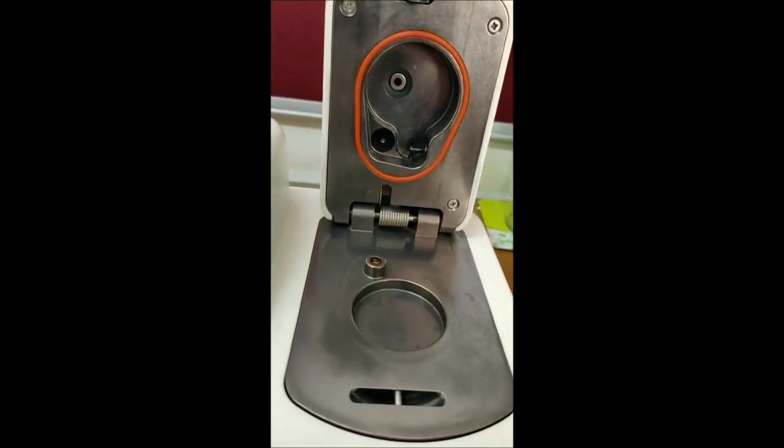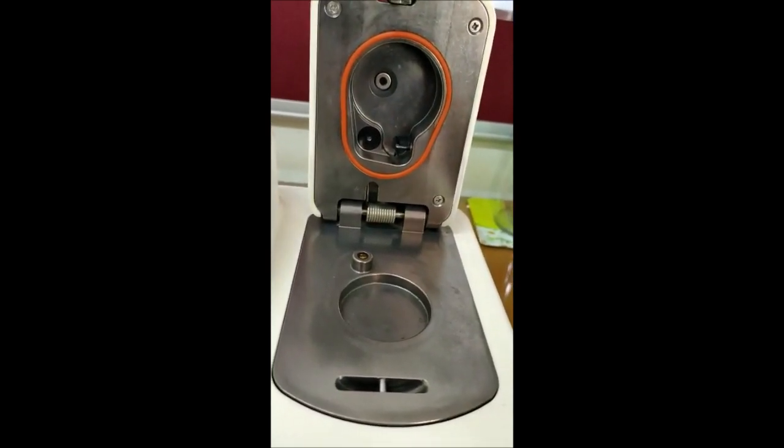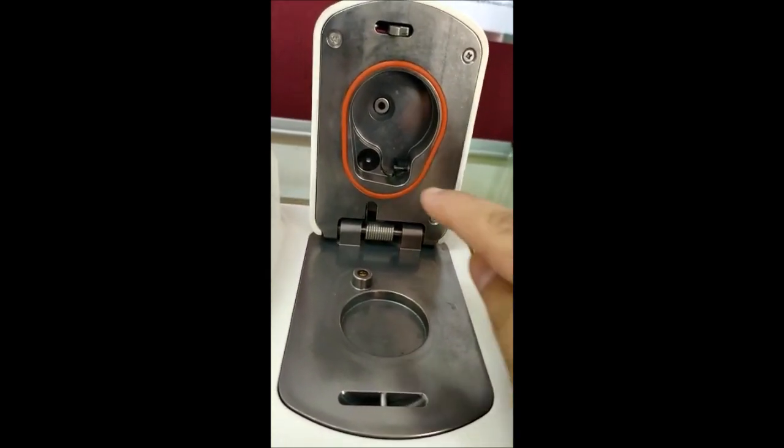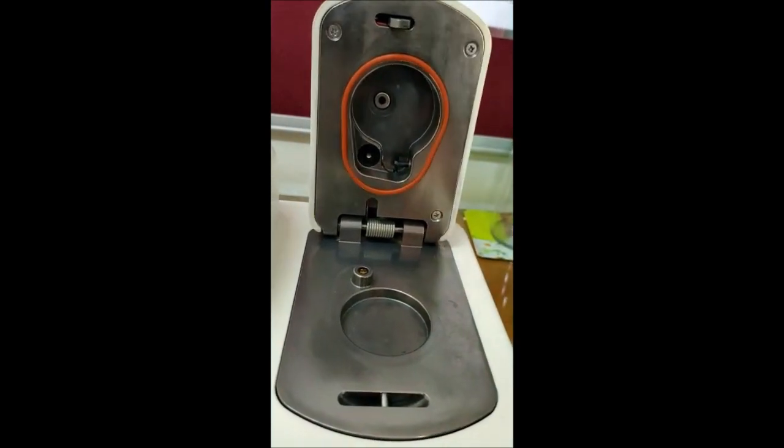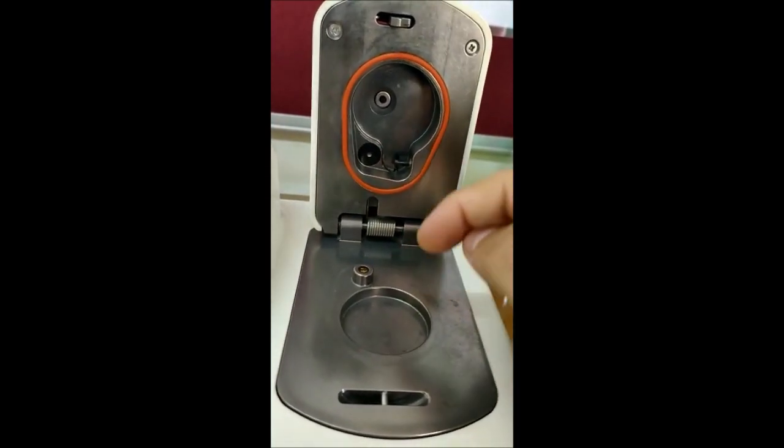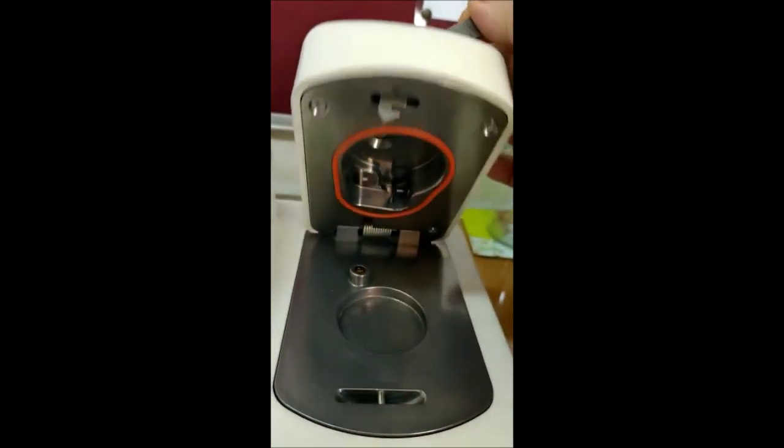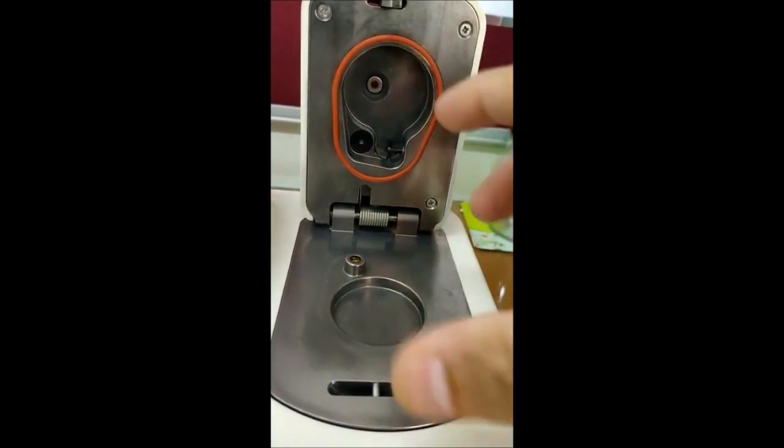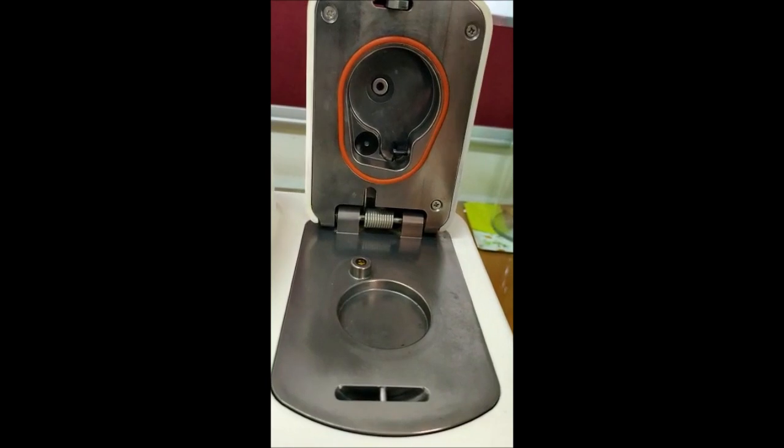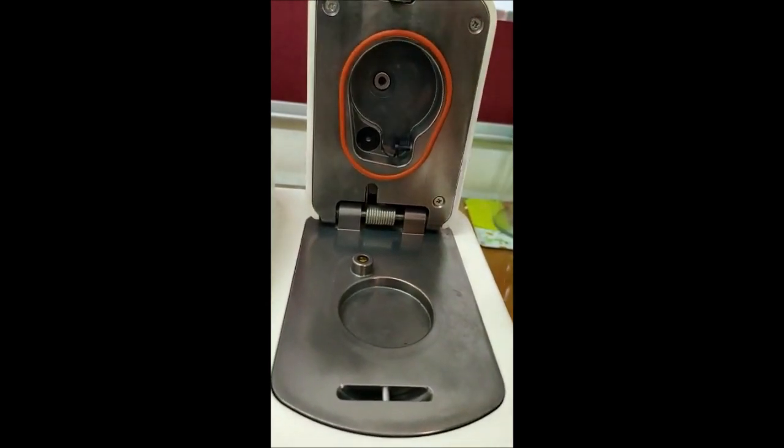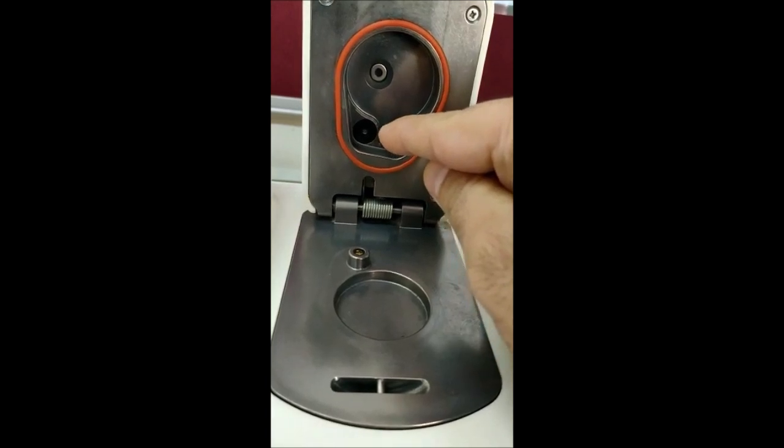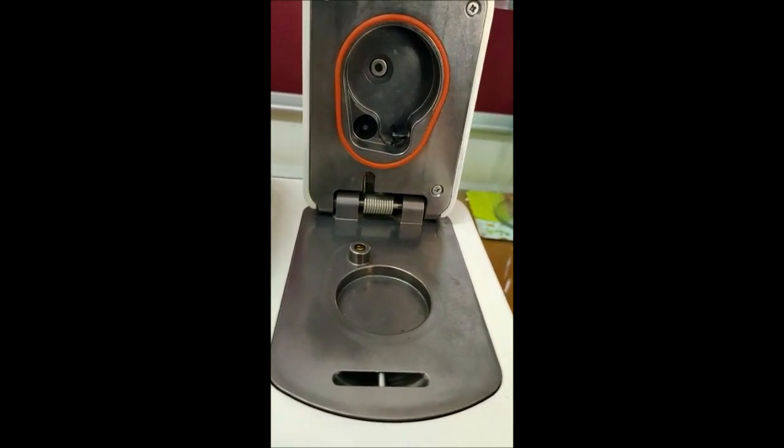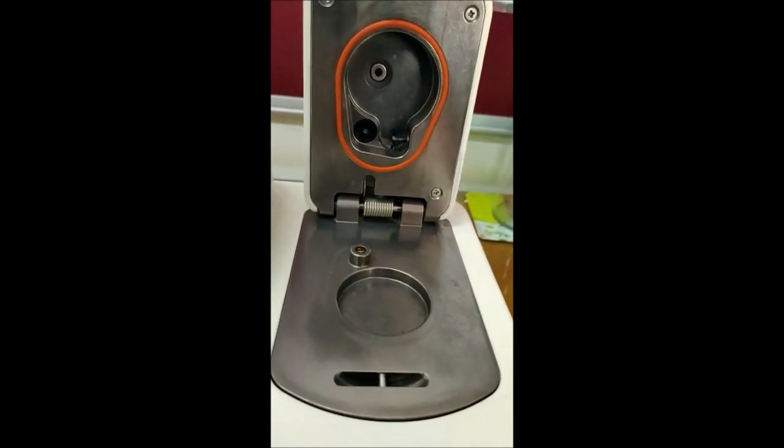How it works? This is basically a chilled mirror dew point sensor based instrument. We have a small mirror, the small dot you can see here. This is a chilled mirror and this is the optical sensor. When we close this chamber the mirror will sit exactly above the optical sensor. What happens when we place the sample, the moisture will migrate in the chamber. And because we are chilling this mirror it will record the dew point temperature. And from that dew point temperature we will get measurement of water activity.